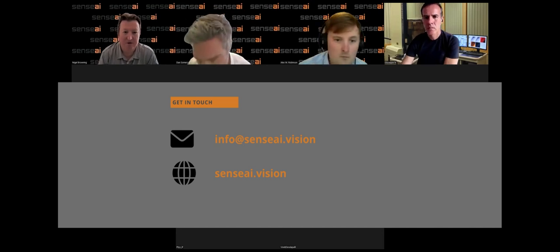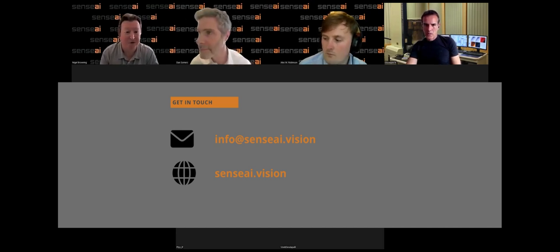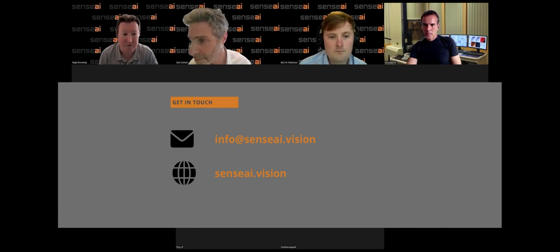Okay, but just let me give a comment on the one before as well. Essentially, when you're using any kind of filtering, you're doing it after the acquisition. So if you already have damage in your sample and you filter it afterwards, you're just going to get a filtered damaged image. The approach here is putting much lower dose into the system. So it's improving the signal to noise and it's putting less dose in there and acquiring faster images. And so that means you can move towards in situ type experiments and you're not going into the damage process.